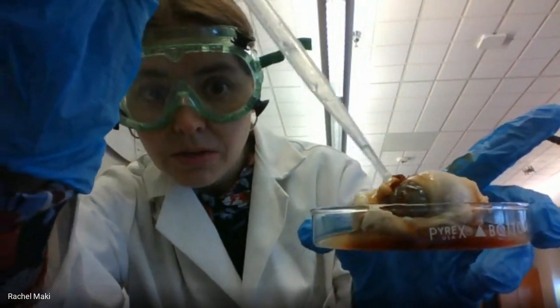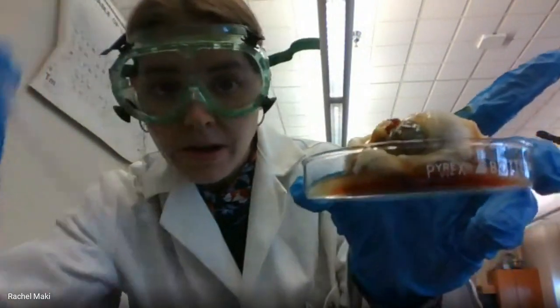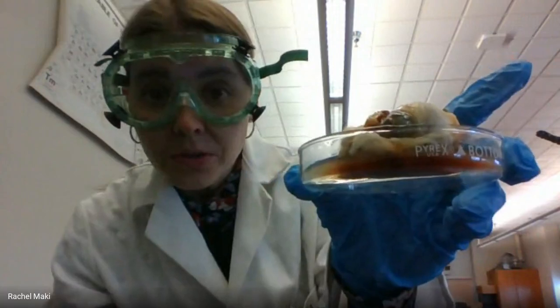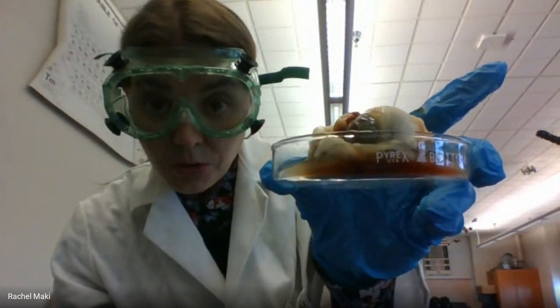So that is the reason why, and you can see in here too, all that dark. That's the acid cooking it. The reason we tell you wear your safety goggles is so that your eyes don't cook.